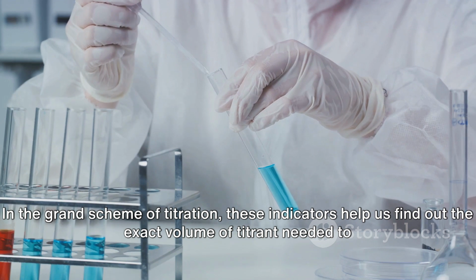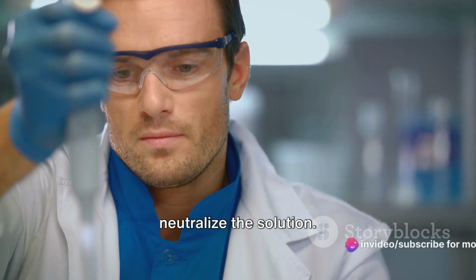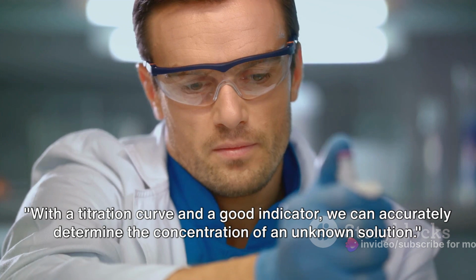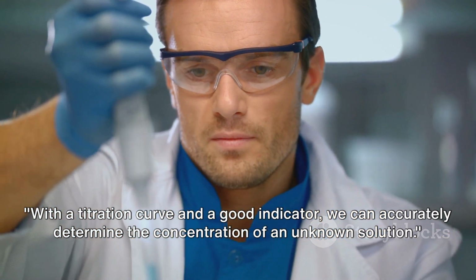In the grand scheme of titration, these indicators help us find out the exact volume of titrant needed to neutralize the solution. This, in turn, lets us determine the concentration of the unknown solution. With a titration curve and a good indicator, we can accurately determine the concentration of an unknown solution.